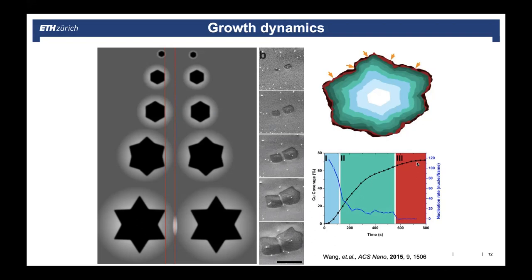So you have a lot of copper in the surrounding and you make growth species somewhere else. And what also is interesting is in our case, only the substrate is hot and in the surrounding everything is cold. So we only make growth species on the hot substrate. Some people, when they use a furnace, the walls are hot, even hotter than the catalyst itself because the heat comes from outside. And then at the hot wall you can also make growth species that rain down on the surface. And that's a very complex chemistry.